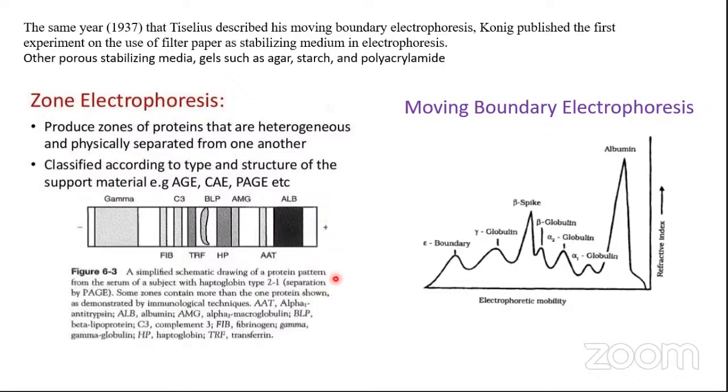Because in electrophoresis, the major force which is acting on the molecule will be the electric field that you are applying, right? So she is trying to say that it will lead to mixing of solute molecules again. But are you trying to refer to it in terms that once you have completed the process of electrophoresis, diffusion is actually a problem? Or is diffusion also a problem during the process of electrophoresis?